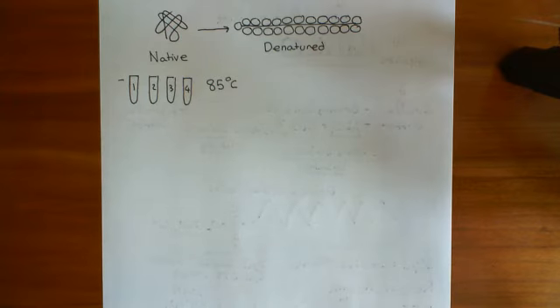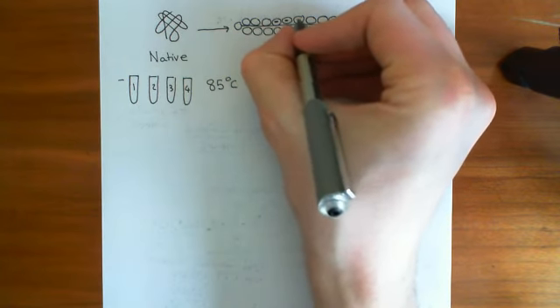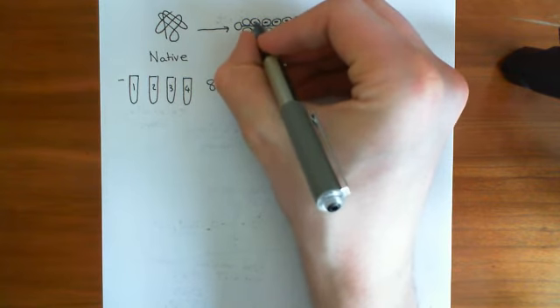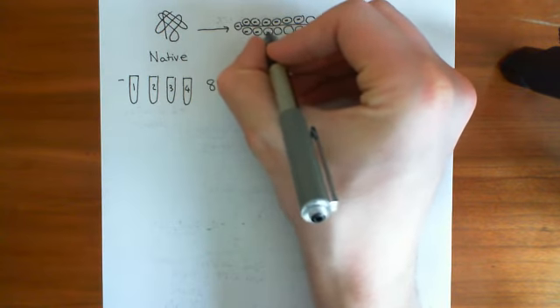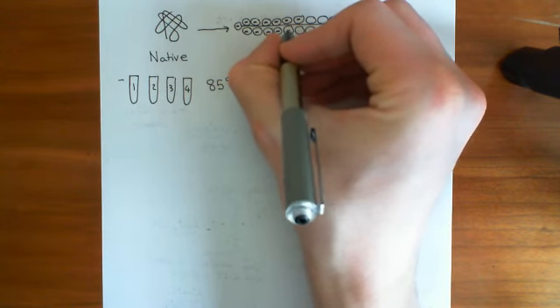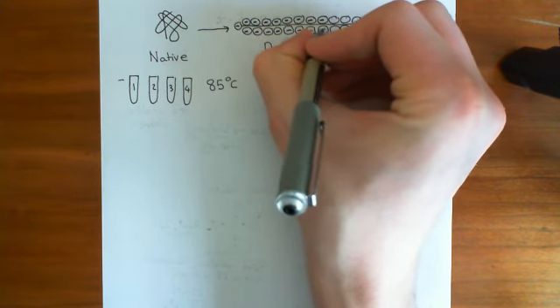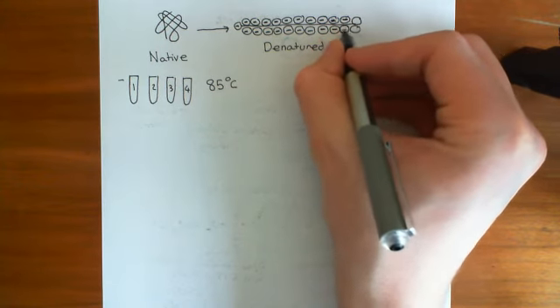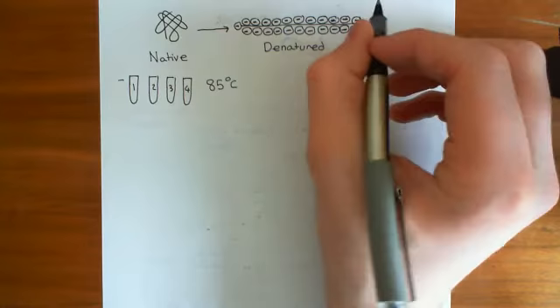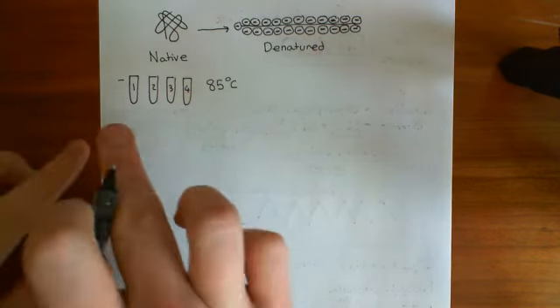However, it does more than just that, because remember, all of these dodecyl sulfate anions have a negative charge, so they're all negatively charged. And we are now going to use this negative charge to separate the proteins out, to make them move when we put them within an electrical potential difference. They're going to move towards the positive, the area of higher electrical potential, because they are negatively charged. Right, so let's think about what has happened in each of these samples.